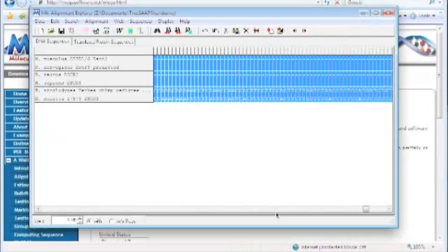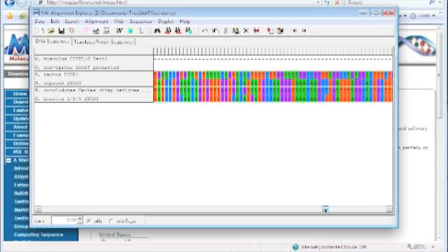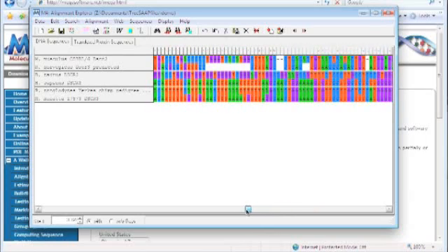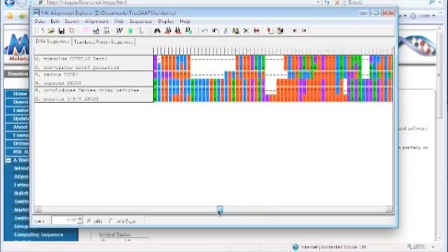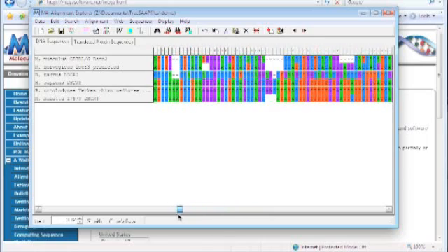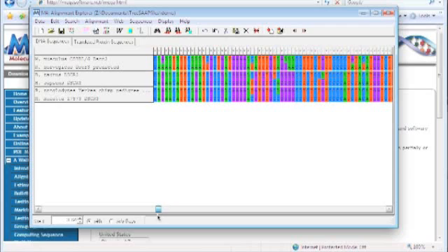Alright, so now that the alignment is completed, we can kind of see — everything is selected, but if we click somewhere else, we can see as we browse through here that there are some regions that are not conserved and other regions which are pretty well conserved. So this right in here, you can see how the vertical lines of color just line up pretty well between the species.